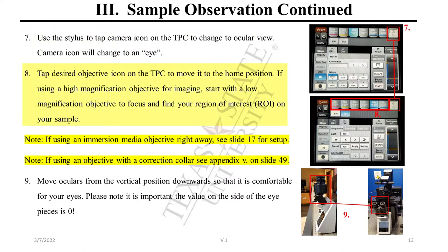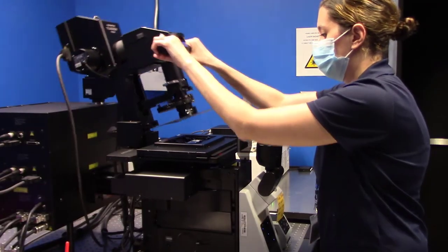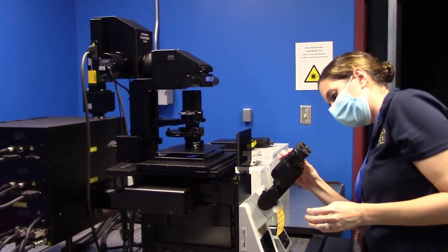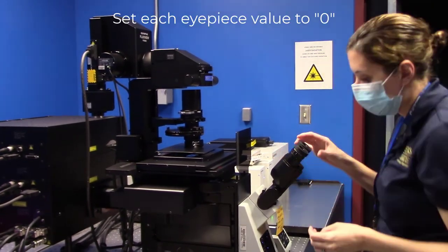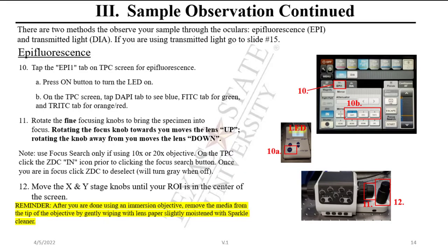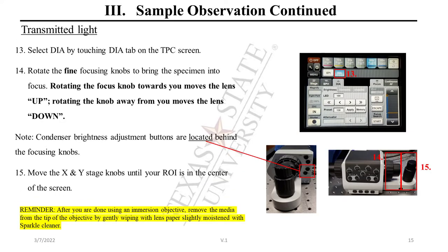Tap the desired objective icon on the TPC controller to move it into the home position. Move oculars from the vertical position downwards so that it is comfortable for your eyes. Please note, it is important the value on the side of the eyepieces is zero. Focus your sample using either epifluorescence or transmitted light.